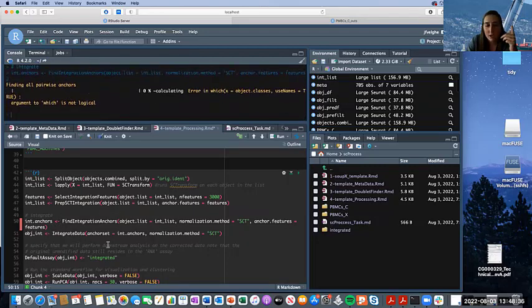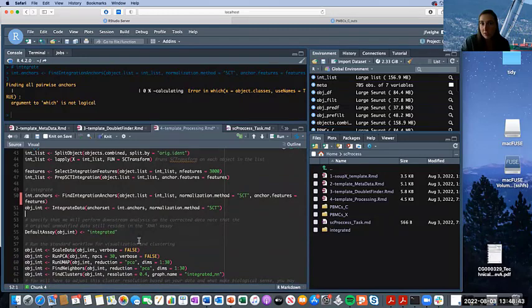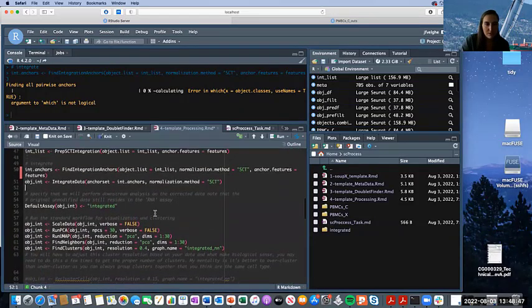Okay, I'm still going to walk you guys through this, and then at the very least, the code will be updated and put on the GitHub in the same folder that you copied this all over from. But I do want to walk you through this because we only have 12 minutes left still.